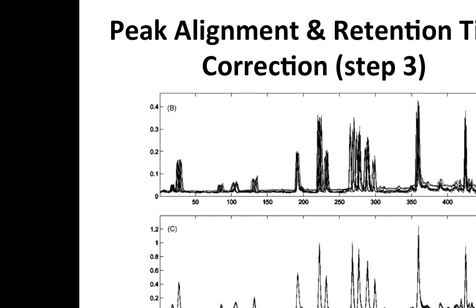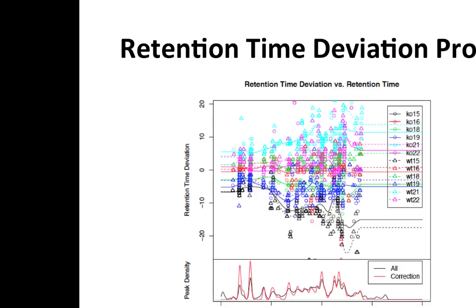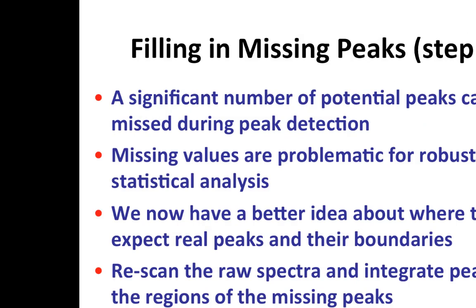So is there a code? No, it's a command in R. Yeah, this is actually a simple command. You need to have this data, sort it according to the MZ, and plot it, and you're going to have a graph like this. If you know a bit of R, it's not difficult to do. So far everybody follows? Okay, good.